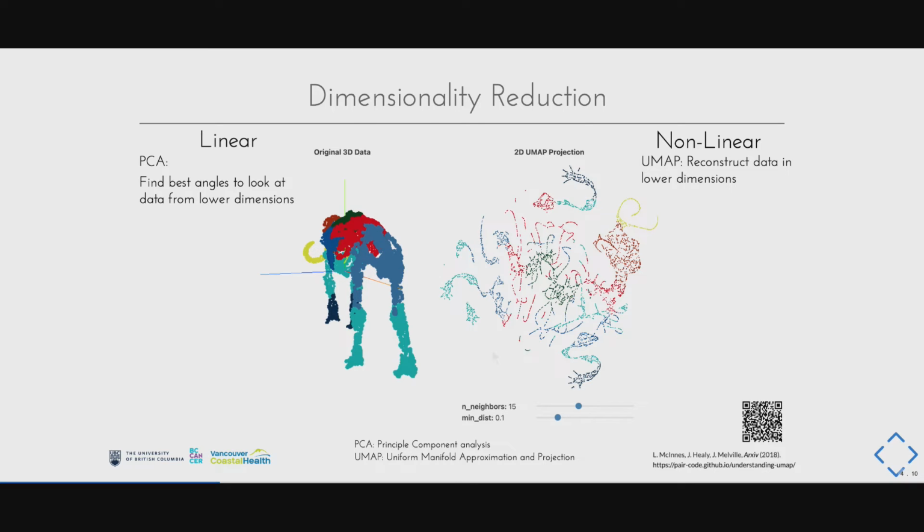Secondly, the parameters in nonlinear dimension reduction algorithms are very important. Changing the parameters will affect the DR plot dramatically. For example, the n_neighbors parameter, which is the number of nearest neighbors, defines the size of the data neighborhood and gives the weight of whether to emphasize local or global structure.